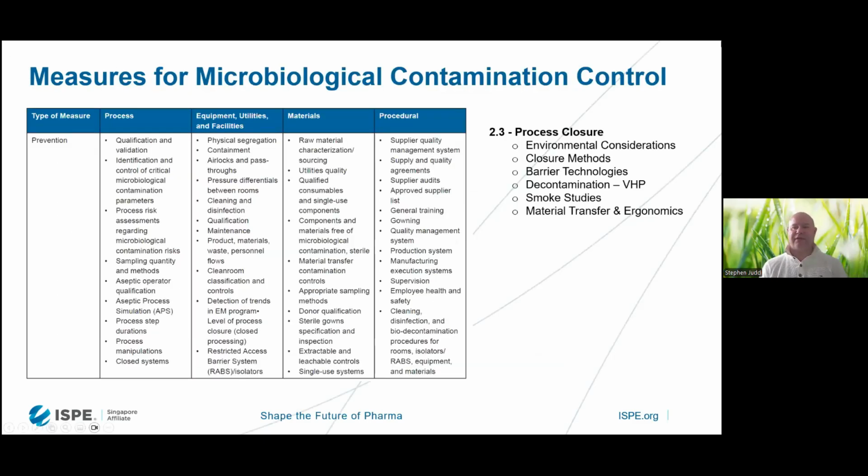So one of the key factors here is around contamination control. One of the big aspects is that over the course of the last 8 years, facility design considerations have changed markedly from the initial approvals through to the latest trends and technologies.